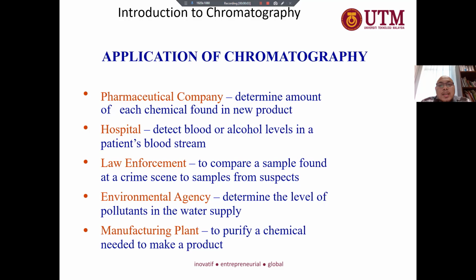Okay, what is the application of chromatography? There are a lot of applications of chromatography. In a pharmaceutical company, it determines the amount of each chemical found in the product. For example, in a hospital, to detect blood alcohol levels in a patient's bloodstream. In law enforcement, to compare a sample found at the crime scene to a sample from a suspect.